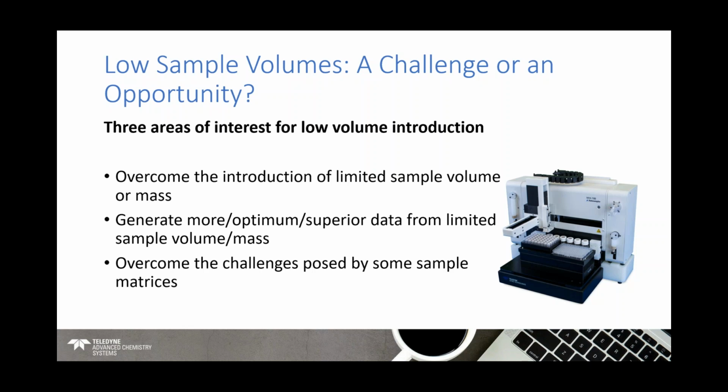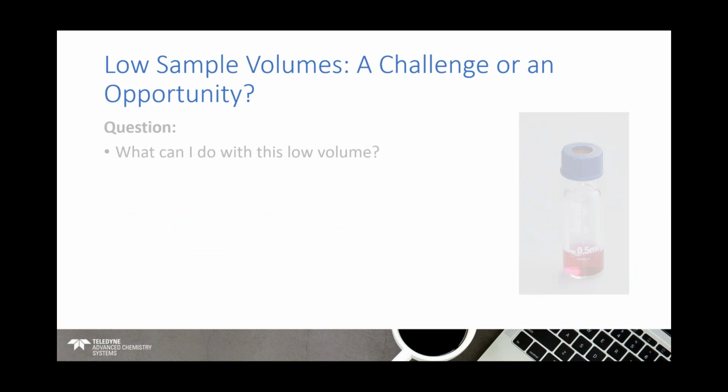That's what I'm going to focus on next. And then I'll briefly touch on using the MVX and low volume to overcome some challenges posed by some sample matrices. So I'm going to focus on this one next, generating more optimal or superior data from a limited amount of sample volume.